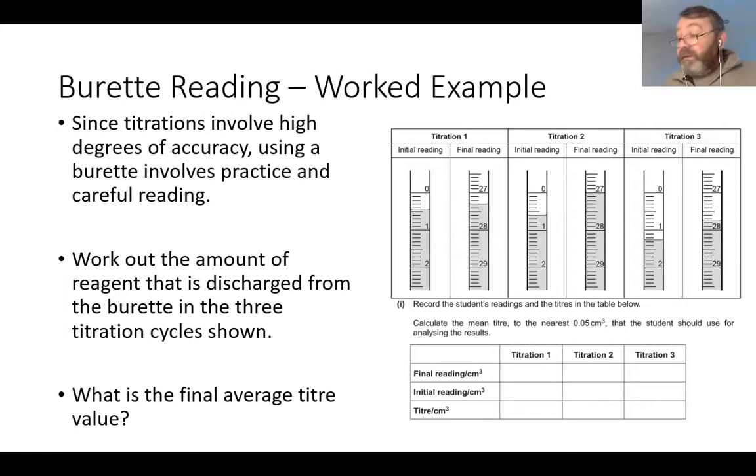And the key thing about it is that because usually in a burette, because it's made of glass, the liquid is U-shaped, like that. We don't read from the sides. We always read from the bottom. See that? So therefore, when we're looking at the value, we always read from the bottom of that U shape. And whatever number is over here, say 5.6, whatever it's going to be, that is the value that you take.